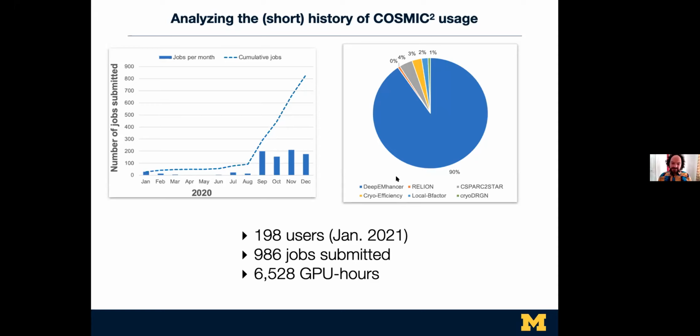That's really nice. DeepEM Enhancer is a software package that runs on GPUs. It runs long enough that it will take up a machine's time. It might take 5 minutes, 10 minutes, or 30 minutes to run. But it ends up being a sweet spot: this is a tool that is enough computing that people don't want to do it themselves or go through the hurdles, but that it actually gives you results that you want to use.